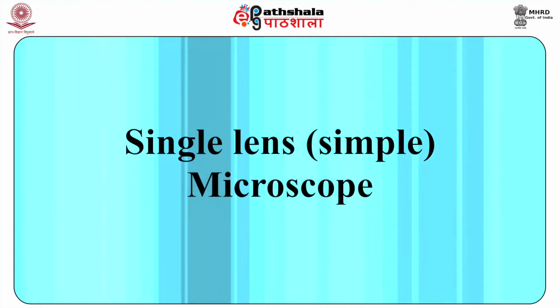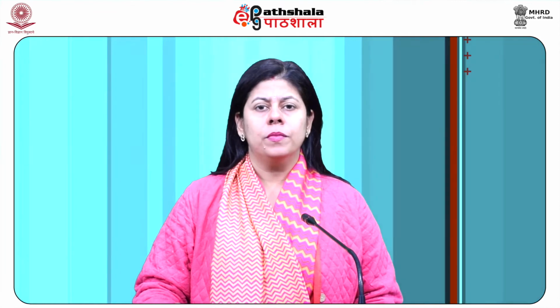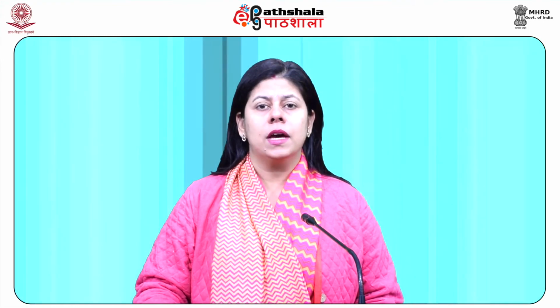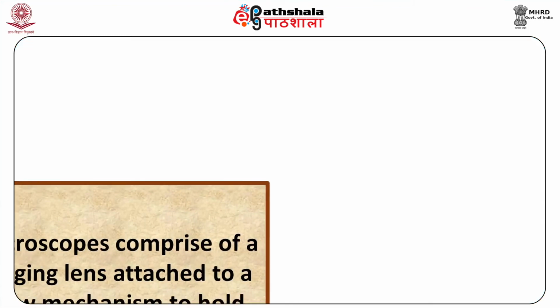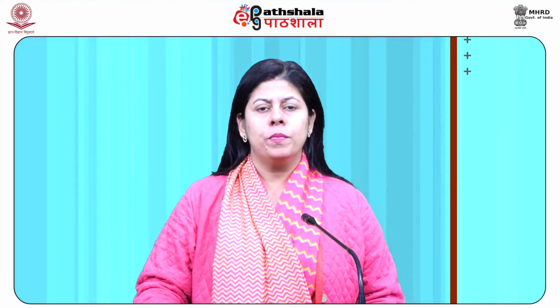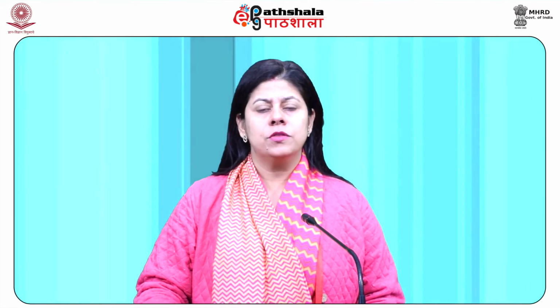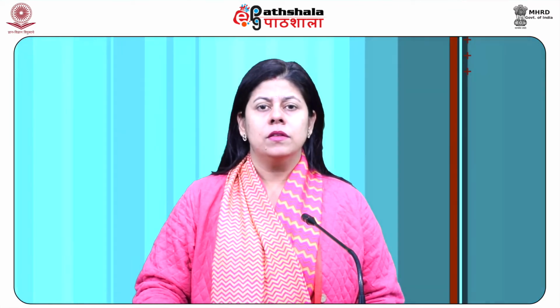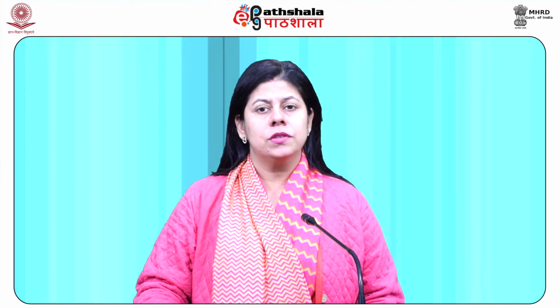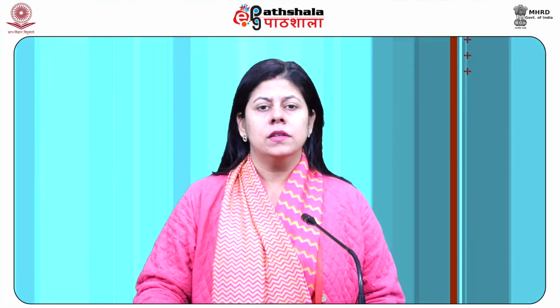Single lens simple microscope. A simple microscope is a microscope that uses only one lens for magnification and is the original design of the light microscope. Van Leeuwenhoek's microscope comprises a small, single converging lens attached to a brass plate with a screw mechanism to hold the sample or specimen to be examined. Demonstrations by British microscopists have produced images from such basic instruments. Though now considered basic, the use of a single convex lens for viewing is still found in simple magnification devices such as the magnifying glass and the loupe.